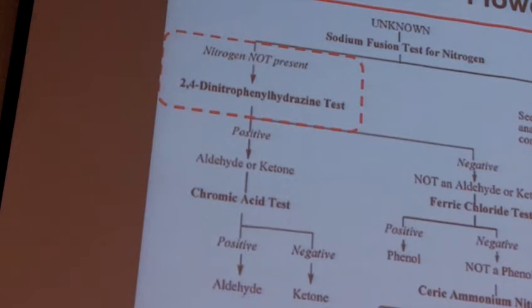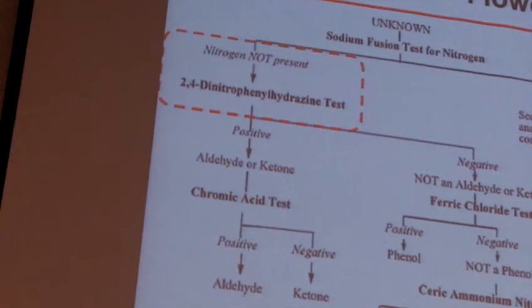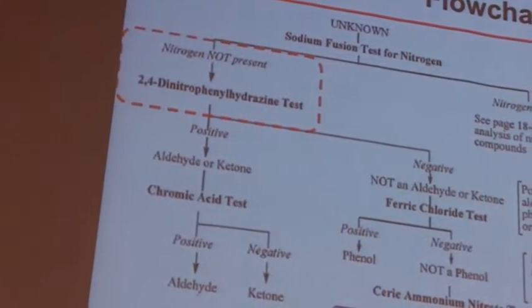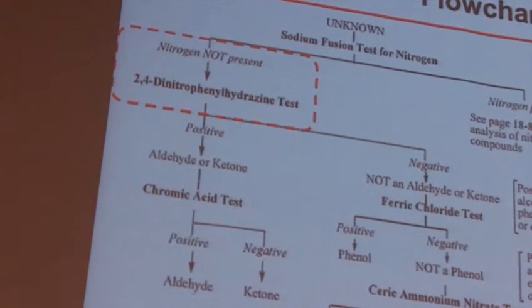Okay? Big star, put that in: no sodium fusion test, which is really good. It's just like a witch's brew, and it looks cool when it works, but it takes a lot of effort to get there. So we will not be doing the sodium fusion test. Any other questions on that? All right, good.